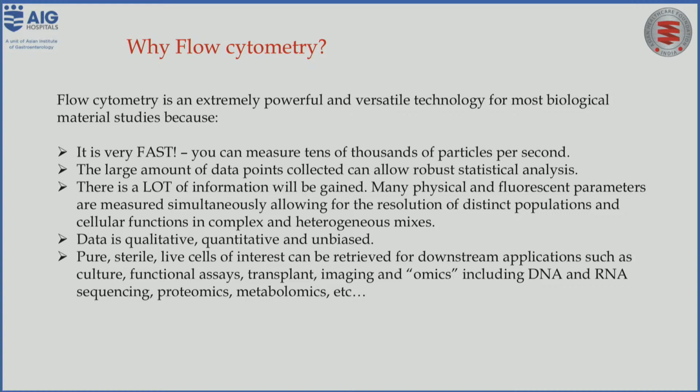Using flow cytometry, we can isolate or sort pure populations of sterile live cells of interest, which can be retrieved for downstream applications such as culturing, functional analysis, transplant or imaging, and omics using DNA and RNA sequencing, proteomics, and metabolomics.